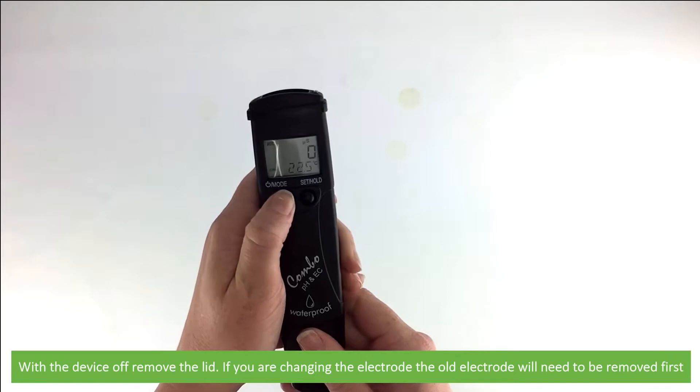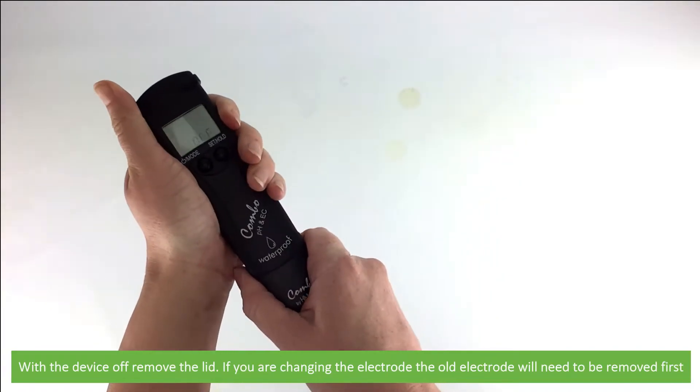With the device off, remove the lid. If you are changing the electrode, the old electrode will need to be removed first.